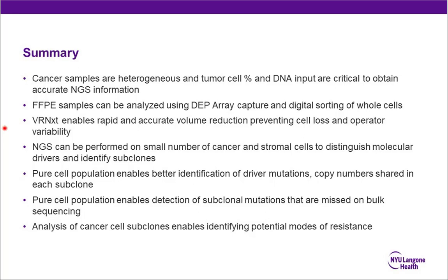So it works really well on CTCs. I assume that if you're interested in capturing peripheral blood cells, it would work as well. You need to keep in mind how many cells you can load into a cartridge so you don't overload it, but it works very well with fresh cells, and there are other people, not us, who have done work with cultured cells as well.